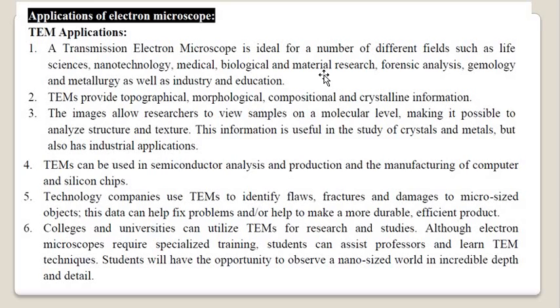computer and silicon chips. Even technology companies use this transmission electron microscope to identify flaws and fractures, even damage to micro-sized objects. This data can help to fix the problem and also help to make a more durable and efficient product.